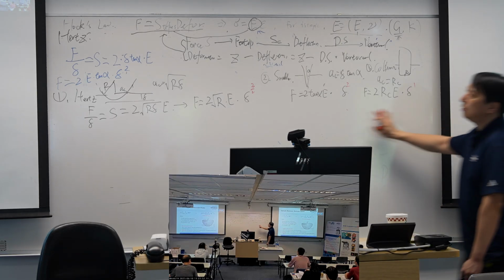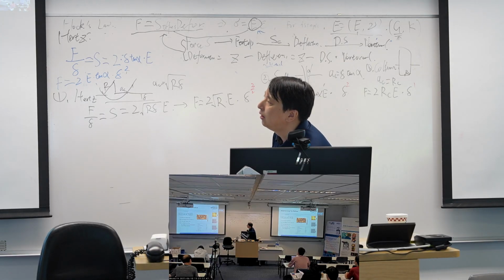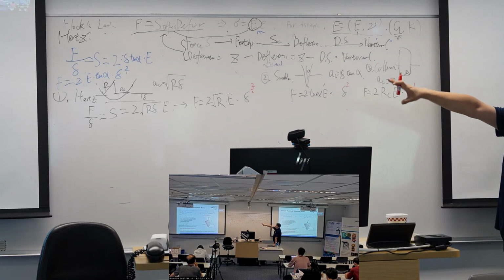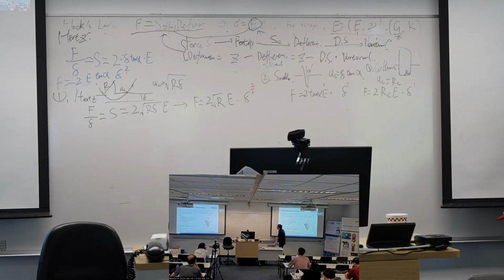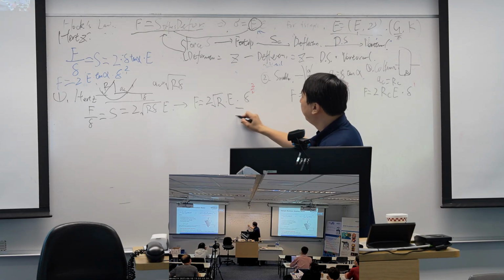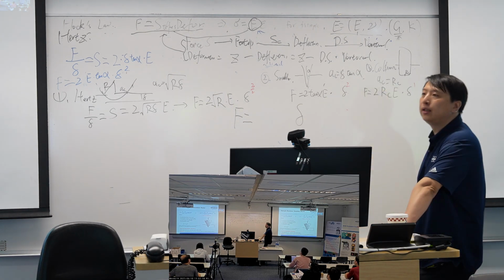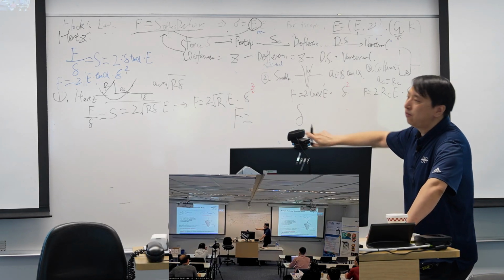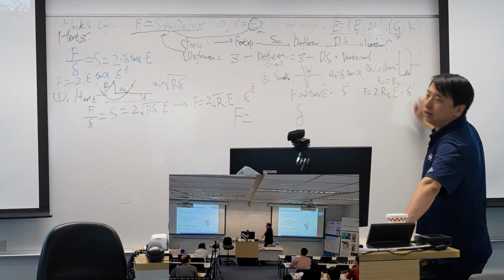So after that, people made a summary. They found that based on the Hertz model, I can make a summary like this. So the force is proportional to my deformation, but the order on this deformation is based on the shape of my indenter.